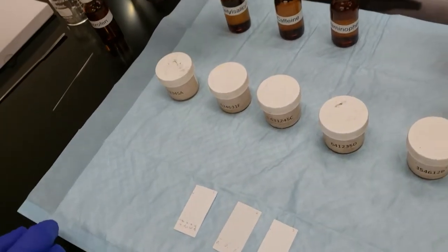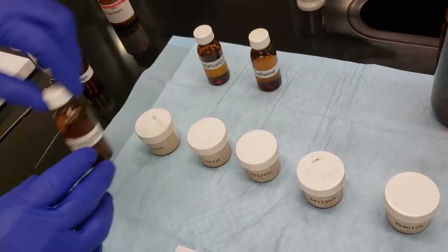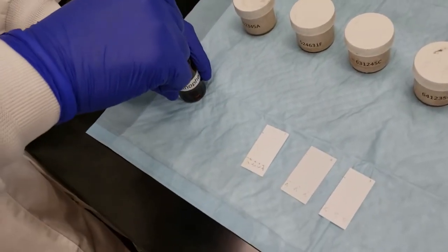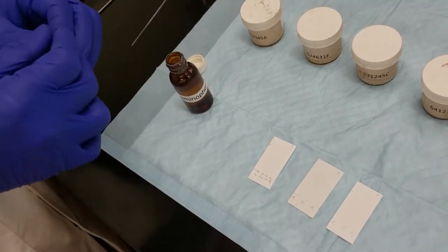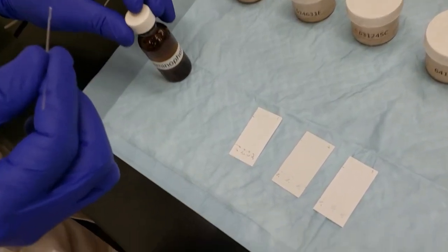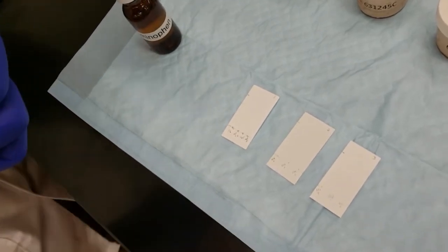Next up is acetaminophen. So here we are. Let's do the same thing. Now acetaminophen shows up very nicely on the TLC plate, so I'm only going to have to spot this one time, or one capillary's worth.